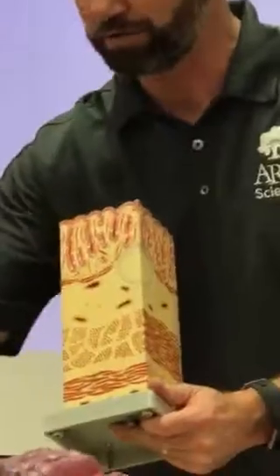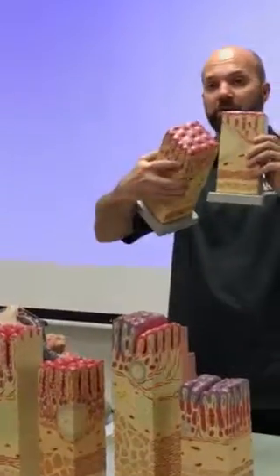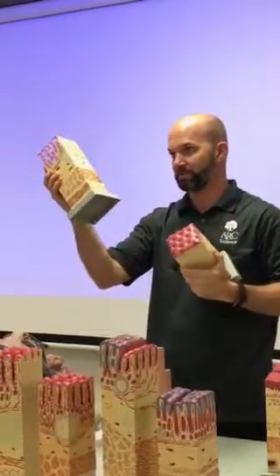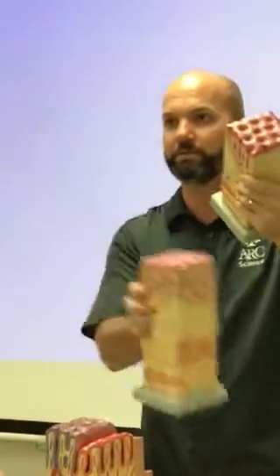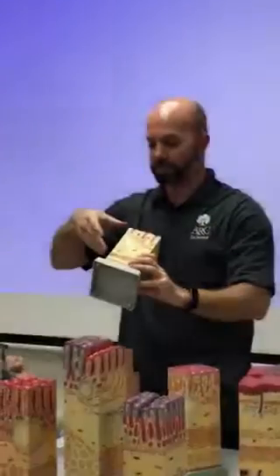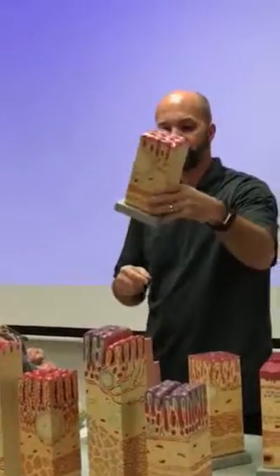These models show about equal numbers of both. Similar, thinner wall, bigger follicle, otherwise pretty similar. This is a modification of this. This is an outpocketing of this. Appendix? This is appendix. So the histology is very similar to the rest of the colon, except the wall is thin, and most of the submucosa is taken up by follicles, huge aggregates of follicles. So this is appendix.